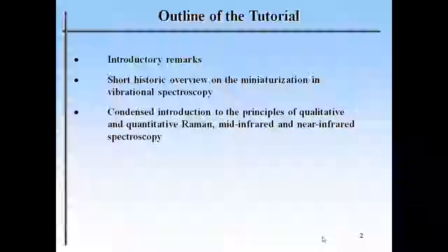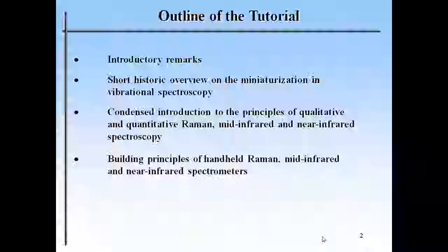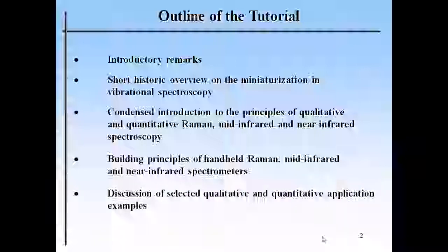I give you, and I apologize in advance if it's a very simple introduction, because I did not know about the heterogeneity of the participants. It's spectroscopy light. It's not spectroscopy zero, it's spectroscopy light. On Raman, mid-infrared and near-infrared, I will talk about the building principles of these handheld instruments. And then, most importantly, I will talk about applications, qualitative and quantitative applications, how you can use them.